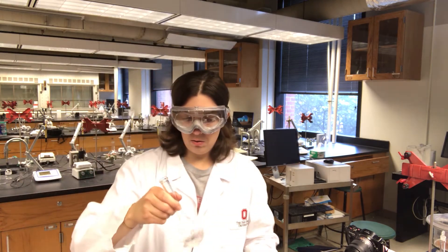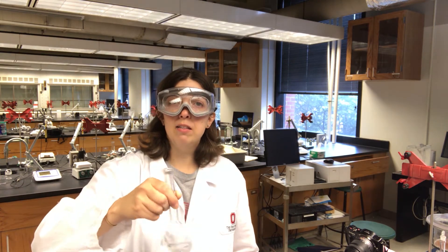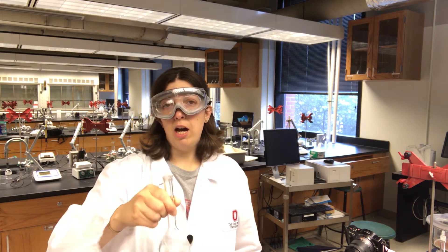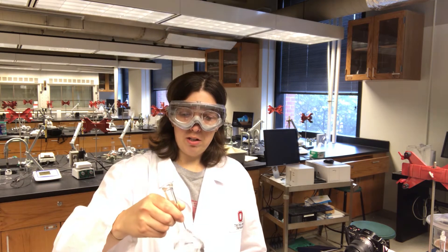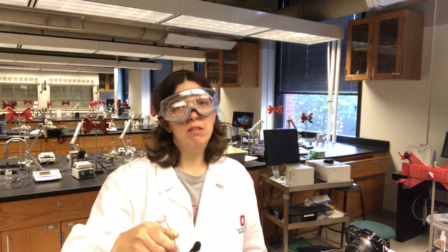In addition to sodium chloride and water, I'm also going to add ionic strength adjuster to the flask. The ionic strength adjuster is going to make sure that the ionic strength of the solution is very high, and that when we measure all of our different solutions, the ionic strength is approximately equal in all of them. That will allow us to measure the concentration of the chloride in the solution, as opposed to measuring the activity of the solution.